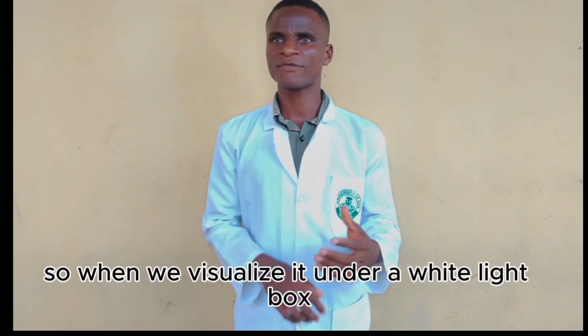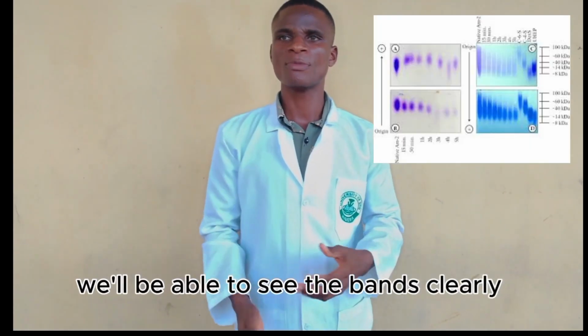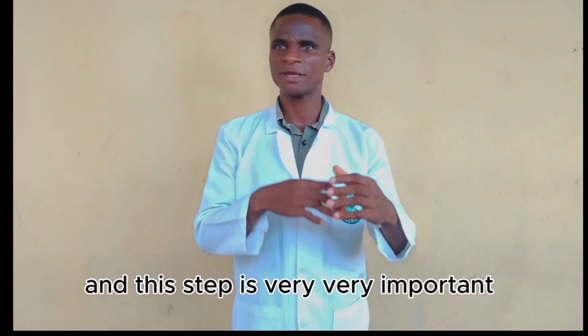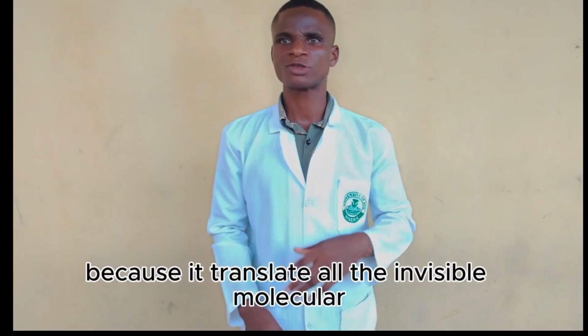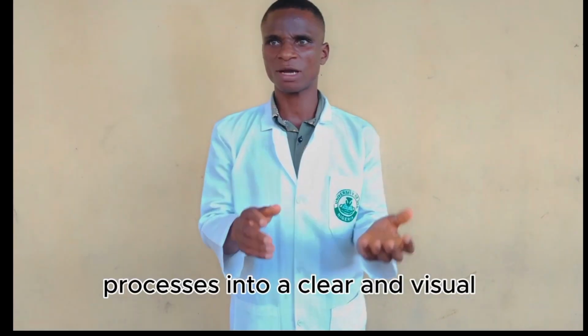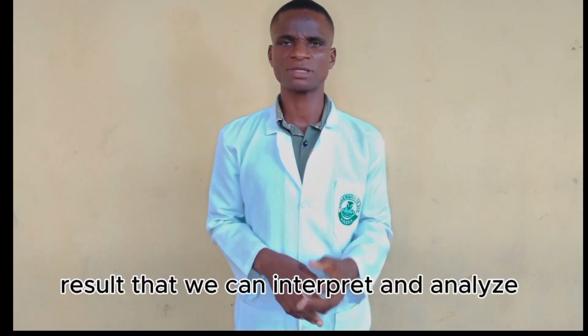So when we visualize it under a white light box, we'll be able to see the bands clearly. And this step is very, very important because it translates all the invisible molecular processes into a clear and visual result that we can interpret and analyze.